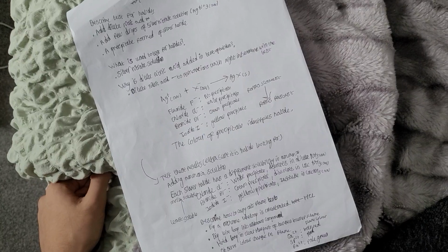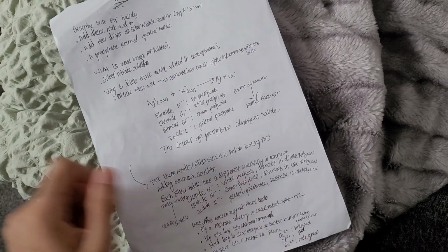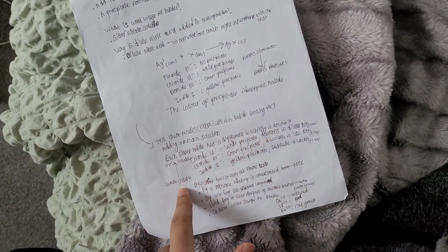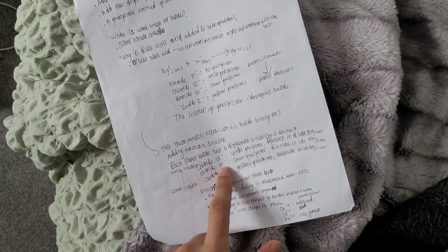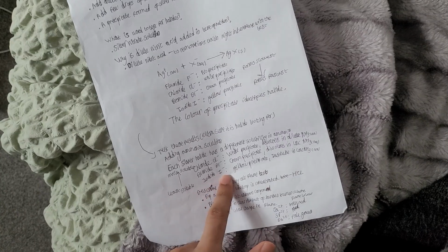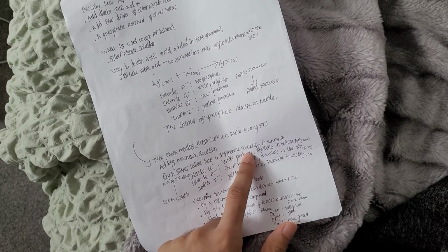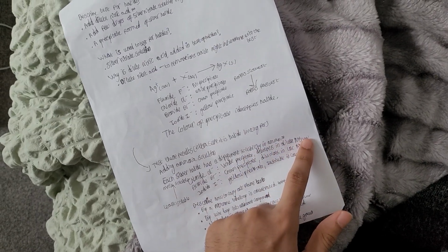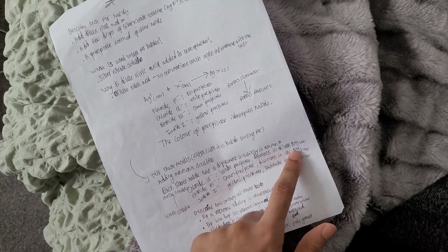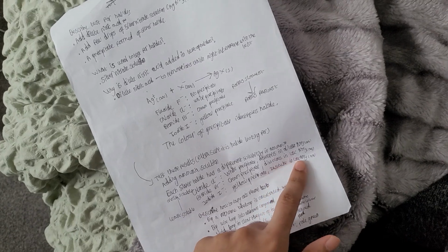Then we want to test these results. This is a bit extra, to make sure it is the halide we're looking for, by adding ammonia solution. Each silver halide has a different solubility in ammonia. You can see chloride, Cl-, Br-, I-, goes from most soluble to least soluble. So I- is least soluble, Cl- is most soluble. With Cl- in ammonia, there's a white precipitate that dissolves in dilute NH3 aqueous. Bromide, Br-, is a cream precipitate that dissolves in concentrated NH3 aqueous. Iodide, I-, is a yellow precipitate, insoluble in concentrated NH3 aqueous.